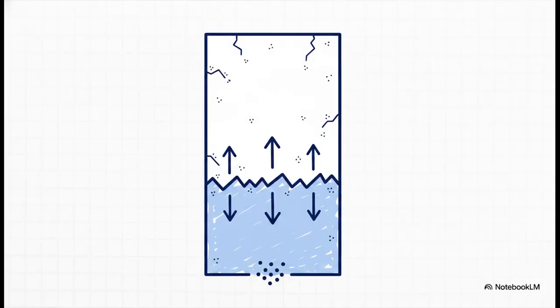Section 3. The equilibration problem, a rush start. Okay, phenomenon number 1. Before your compounds even budge, the stationary phase on the plate is only partially equilibrated with the liquid phase. Think about a column system for a second. You can just pump solvent through until everything is perfectly stable before you ever inject a sample. But in TLC, that solvent front is aggressively pushing into dry, unequilibrated territory. So right out of the gate, your molecules are dumped into an inherently unstable, shifting environment.